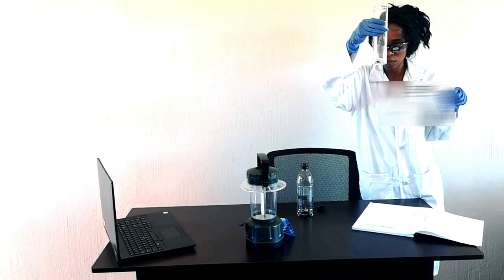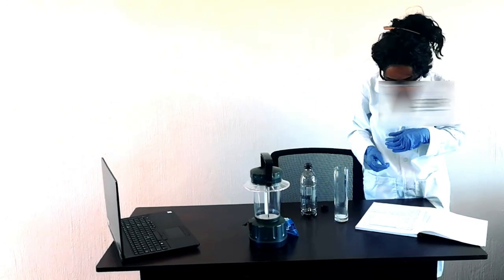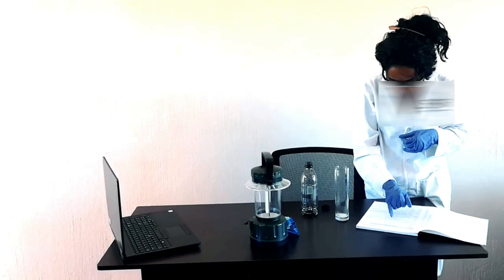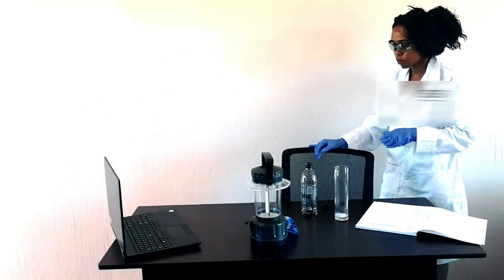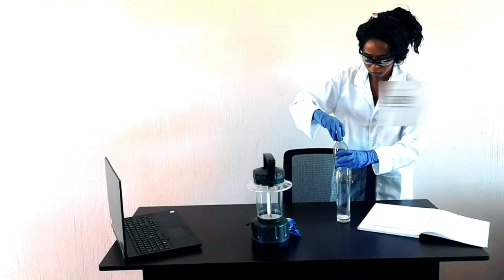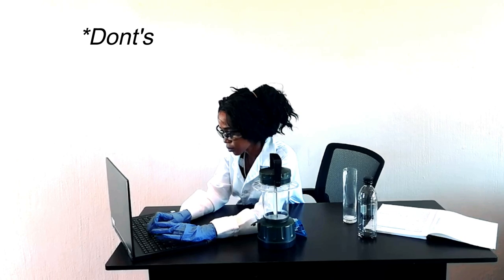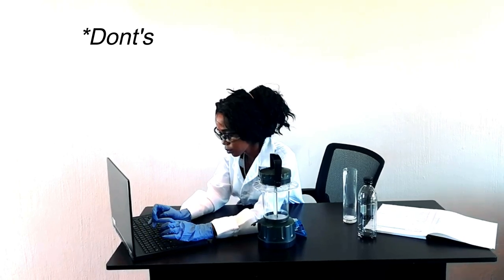They forget to wash their hands, they start biting their nails or scratching their face or whatever it is. Now they've ingested the chemicals that I was using, or they've transferred the chemicals onto their face. So let's try, guys, to remove gloves before we start touching things that other people use.